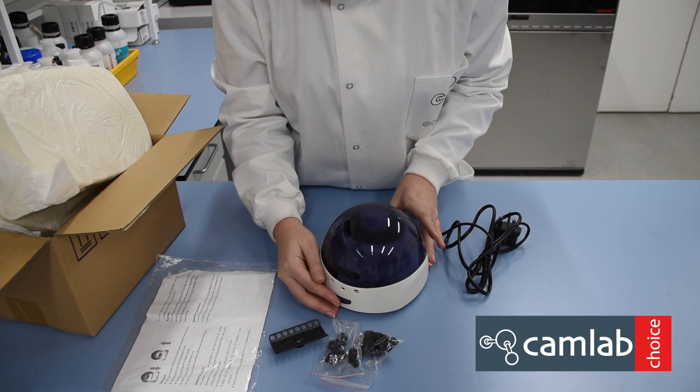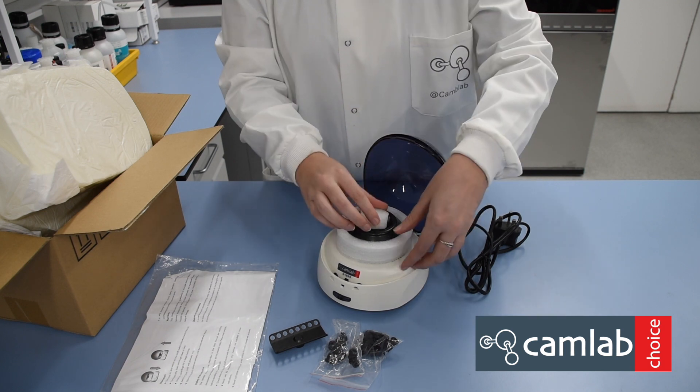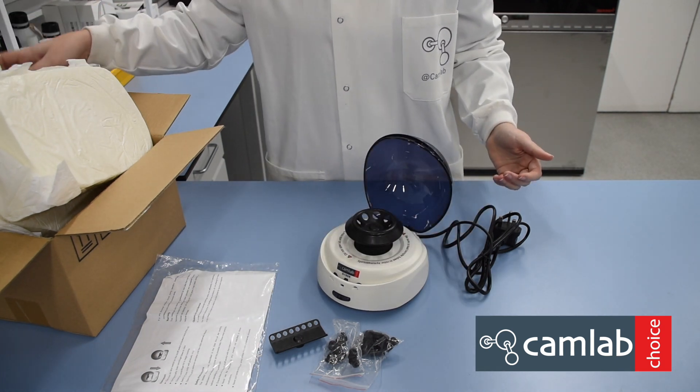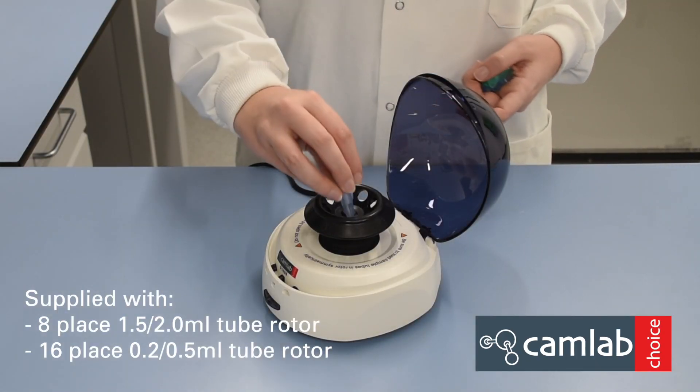To open the micro-centrifuge, click the button at the front and lift the lid. Inside you have the tube rotor. Symmetrically load centrifuge tubes in the rotor.